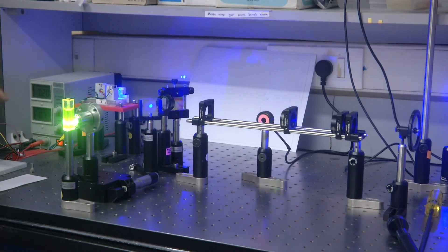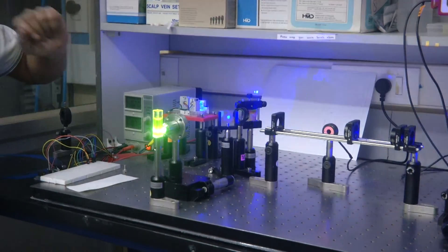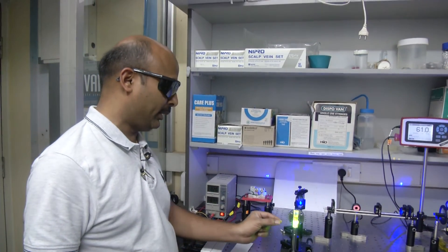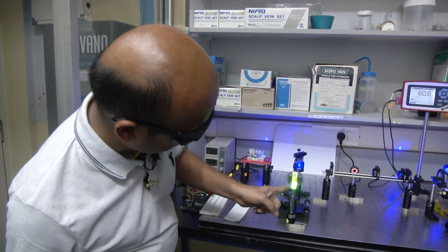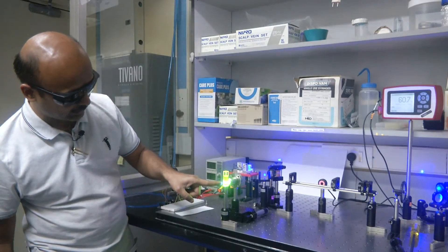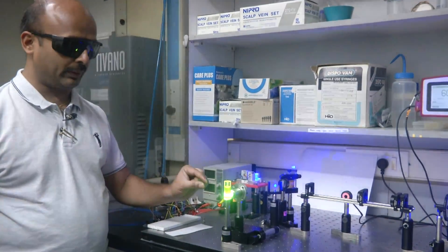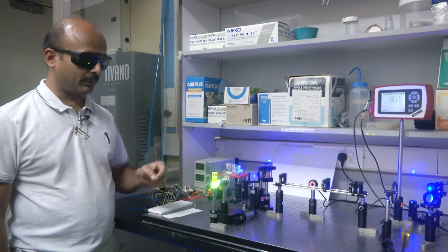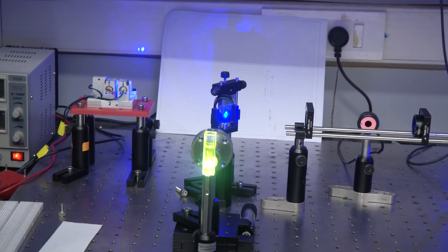What we have actually done is that we have done this in the lab in a completely open setup and been able to show you that it is very simple and easy to follow. Now this is done through one-photon excitation. That is why you see this fluorescence as a big streak. In fact, if you see it from this side, it is nicely on one little spot which is wider, but on the other side you can see it as a streak of line. And later we will see if we do the same thing in two-photon, it is a very sharp and localized fluorescence. On top of it, you will see that it has some characteristic feature that requires the laser to be pulsed. These two things we will see in the forthcoming classes. Thank you.